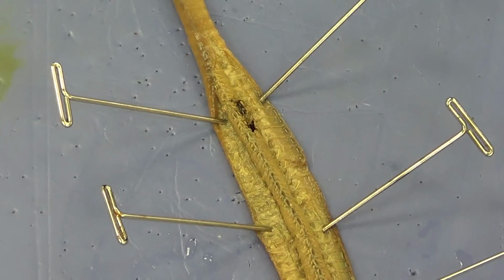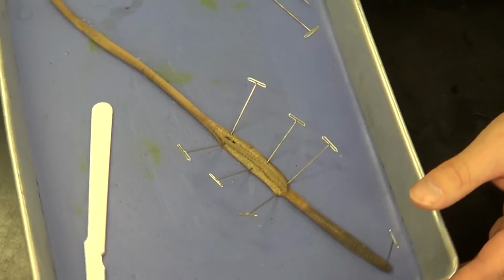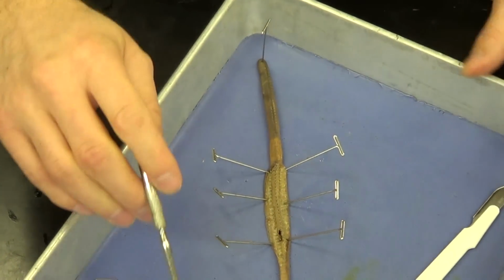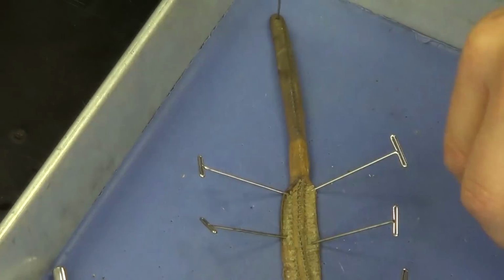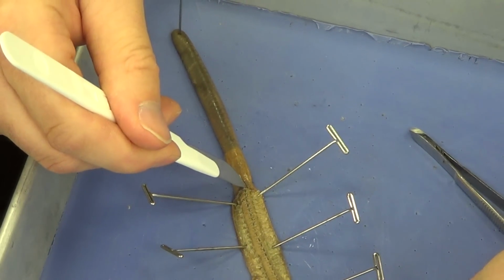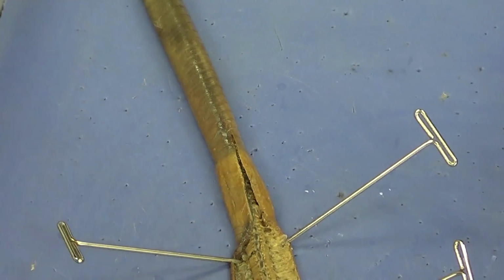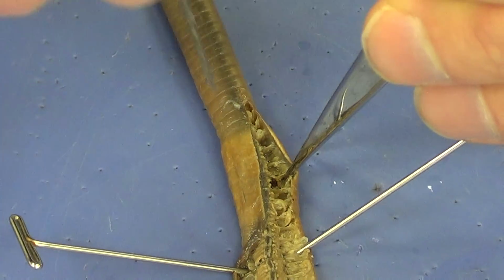After you've gotten there, you've gotten in some practice, then go ahead and turn the earthworm around, and let's begin working towards the anterior aspect of the earthworm. And what you're going to do is just cut right through that clitellum as though it weren't there. So again, cutting very shallow, about a half an inch to an inch at a time, I'm going to cut right through that clitellum. And with my forceps, I'm going to pull back the skin very gently.